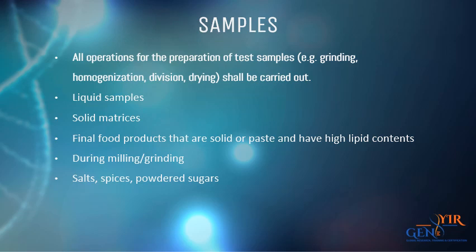Samples. All operations for the preparation of test samples, for example grinding, homogenization, division, drying, shall be carried out. For liquid samples, shake the vessel containing the sample to improve the homogenization of the product. In the case of non-homogeneous products like raw oils, check that the sediments have been completely removed from the walls of the vessel. For solid matrices that cannot easily be suspended, the matrix shall be ground to reduce the particle size and/or facilitate the extractability of DNA. In such a case, attention shall be paid to the particle size.